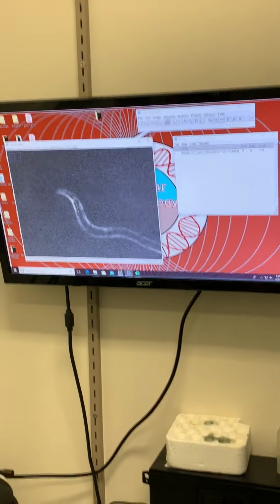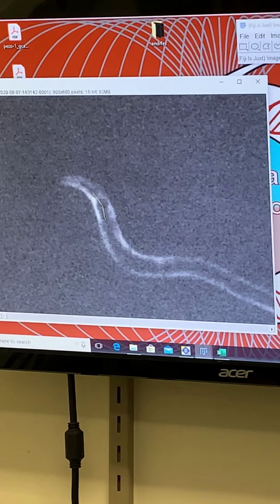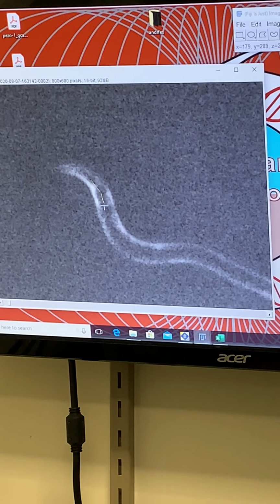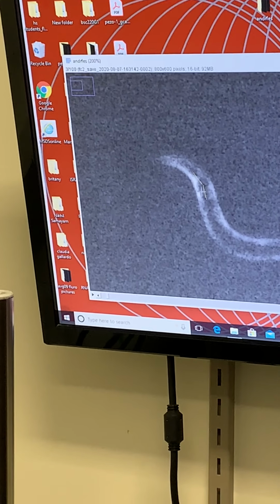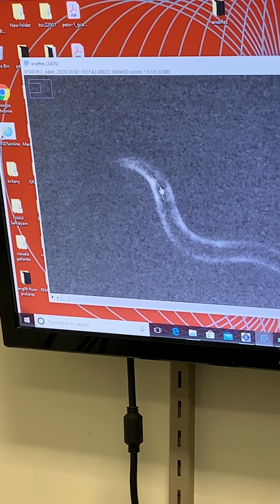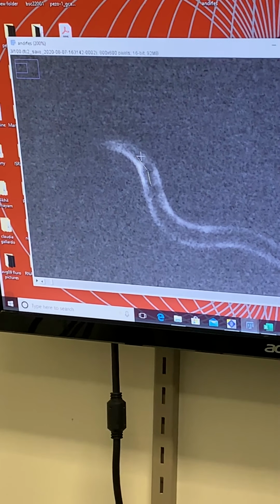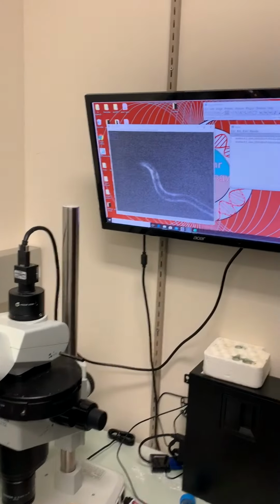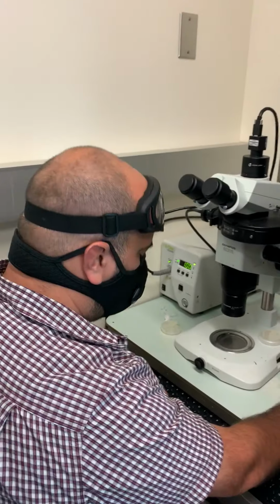Then I forward 1 frame, and I go again, and I forward 1 frame again, and I go. Try your best to put these dots halfway between the edges of the worm, and in every one of them, you know, all 3 dots have to be about at the center of the worm. You can move this around a little bit if you want, if you're not too happy. But this is the part that is important to get right, because if you get this a little bit wrong, that's a whole lot of degrees that you're gonna get wrong, and that's gonna really impact the results.